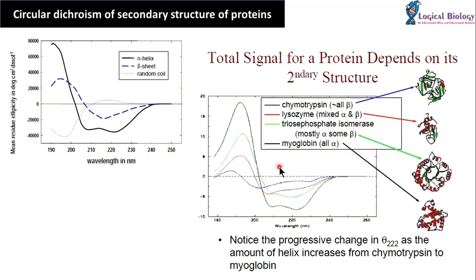So we can see here we are getting very good similarity between these graphs and these standard curves, and this method can be used for any CD spectroscopy. There are software and algorithms. So when you run an unknown sample for CD spectroscopy, those programs just fit the band values of the unknown protein with the standard curve, and they tell you the percentage of alpha, the percentage of beta sheet, whether they are mixed alpha and beta, or alternatively alpha or beta.